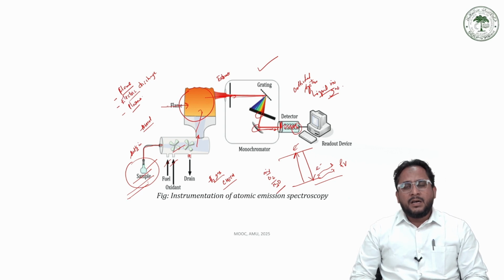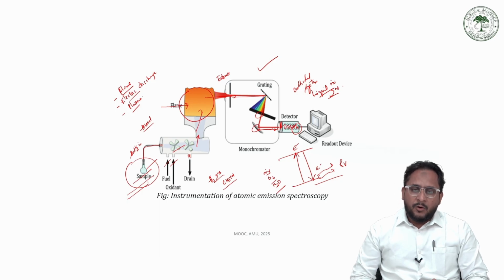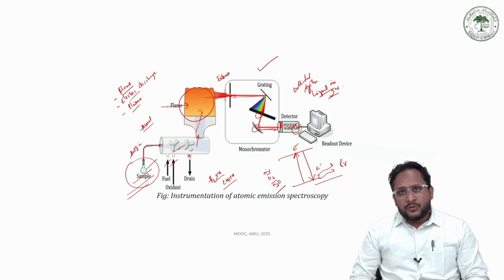With this, I hope that you have got a brief idea about the working of the atomic emission spectrophotometer. In the next few lectures, we will discuss its components and how plasma is generated, which is very important for you to learn for competitive examinations as well as for job interviews.